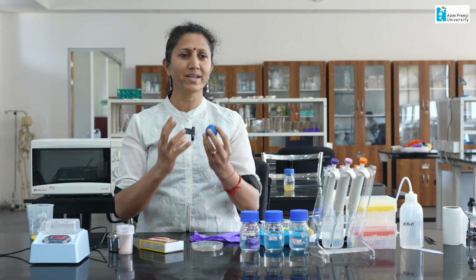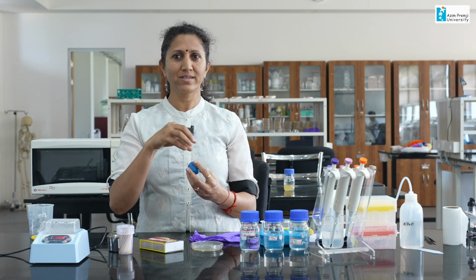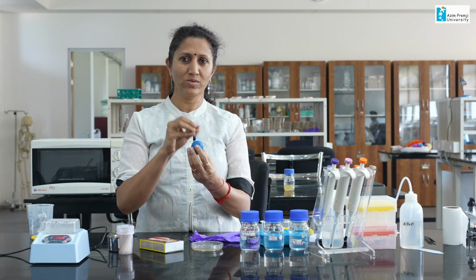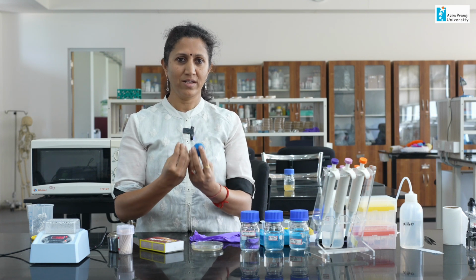Usually when you draw the cell in the textbook, you do not think it is 3D or has a volume. You just draw a flat diagram, but actually a cell has a volume and it has cell contents like cytoplasm, other cell organelles and a nucleus, and inside the nucleus there is DNA. I made a clay model to demonstrate how it looks and what contents have to be removed if I have to get the DNA out of the cell.